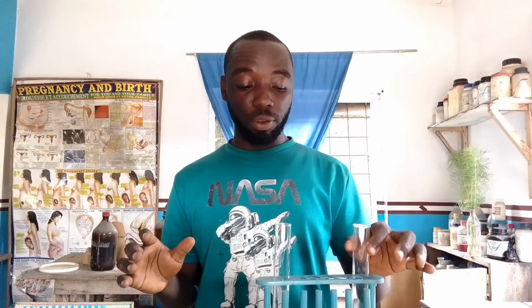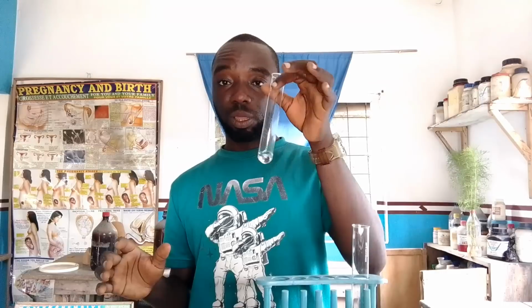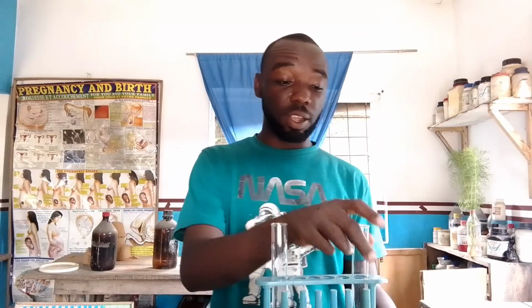And here we already have our 1% copper solution. So now what you are going to do is you will be asked to put some drops of sodium hydroxide right into the egg solution, and also you'll be asked to add the same thing in this water solution, which is specimen H and specimen G. This is our specimen G and this is our specimen H. So now let us begin.